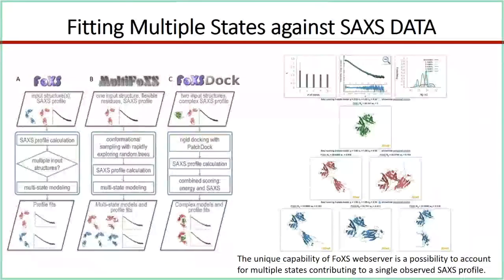Inter-subunit or intra-chain interactions that are already known either from high-resolution structures or binding studies or mutation studies, biochemical studies. If you are looking at protein-nucleic acid complexes, then if you have mutagenesis studies and electrophoretic mobility shift assays to show which residues are involved in interacting with each other, those are important constraints to use.